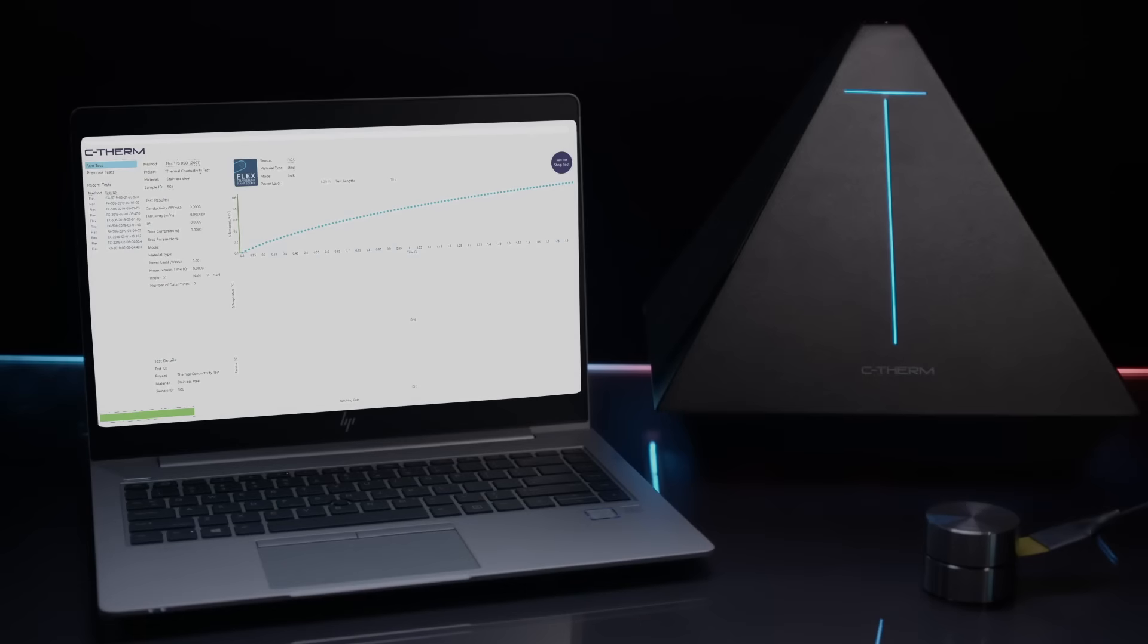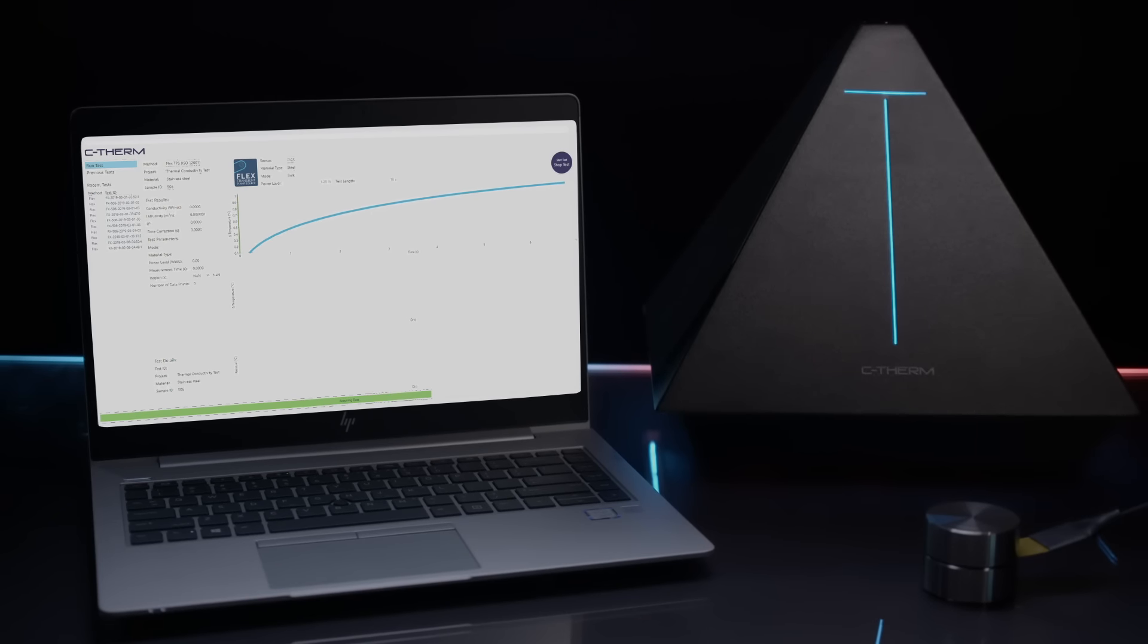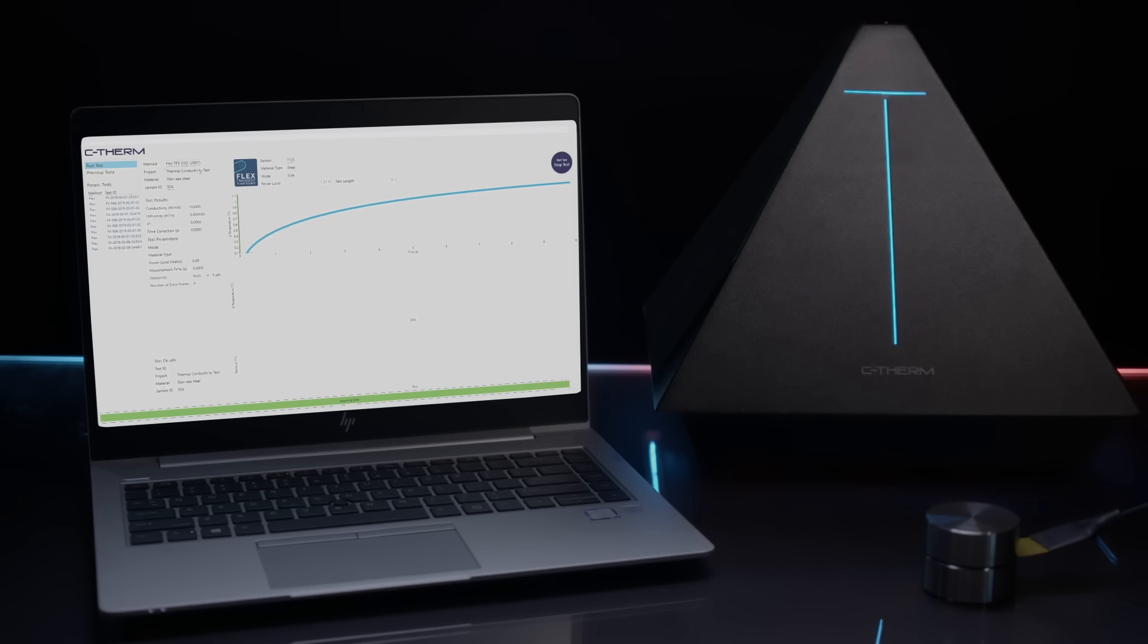C-Therm software provides full data acquisition and analysis in one user interface, allowing full control of all three methods. Intuitive, logical, easy.